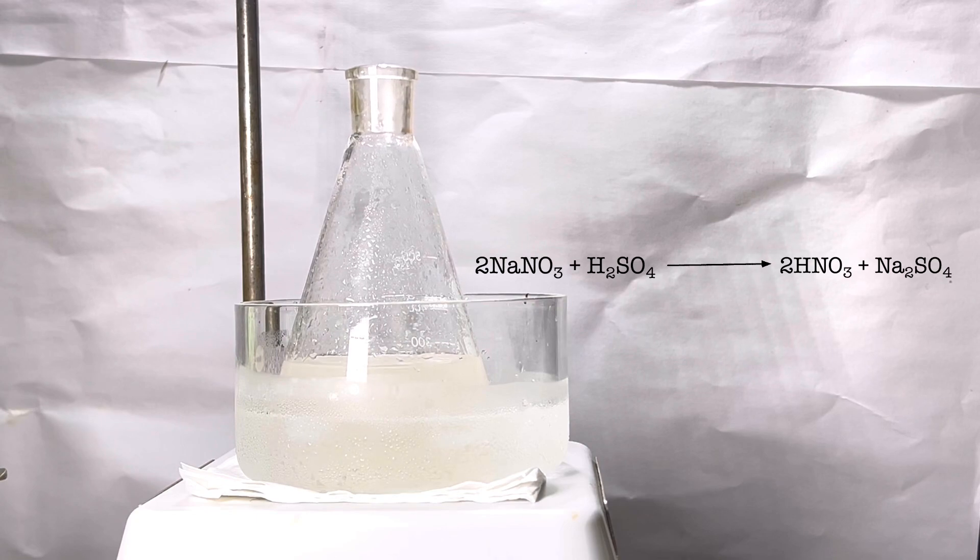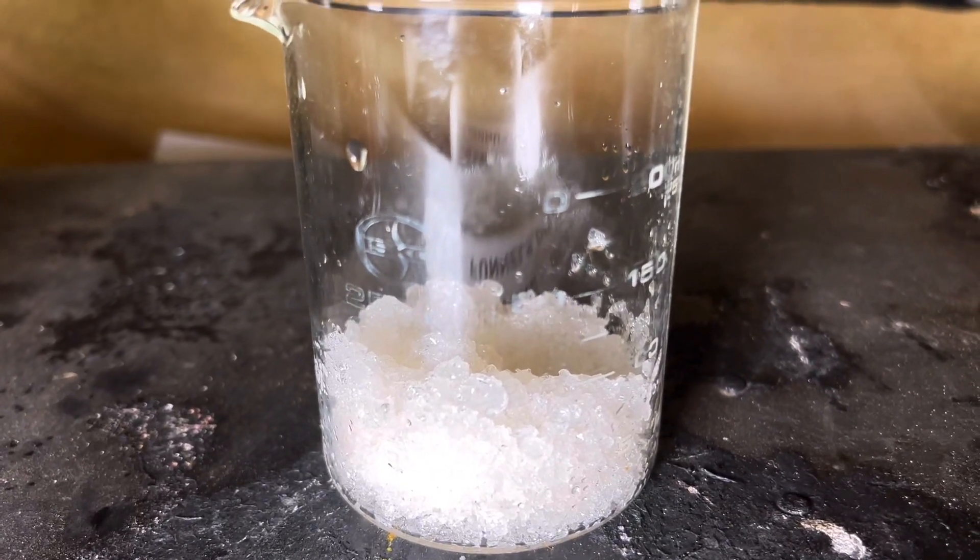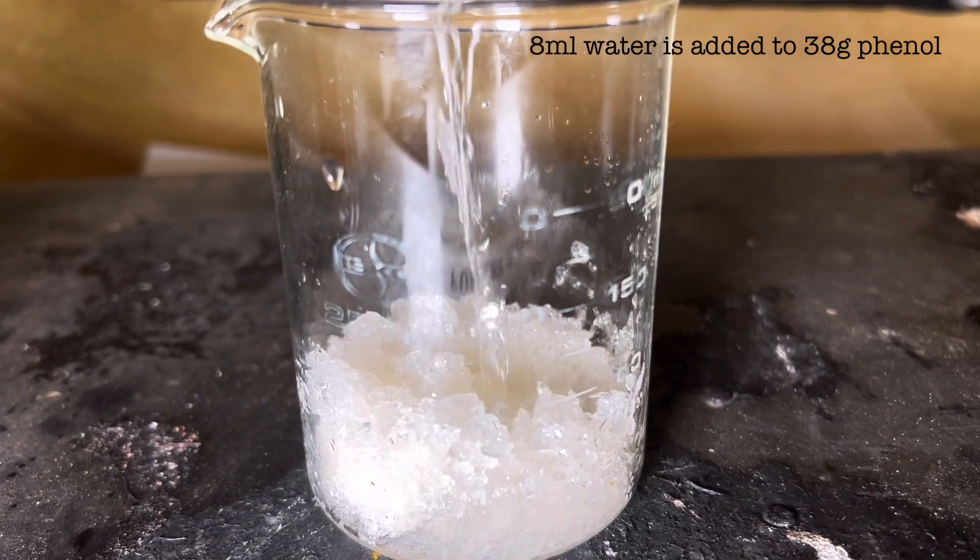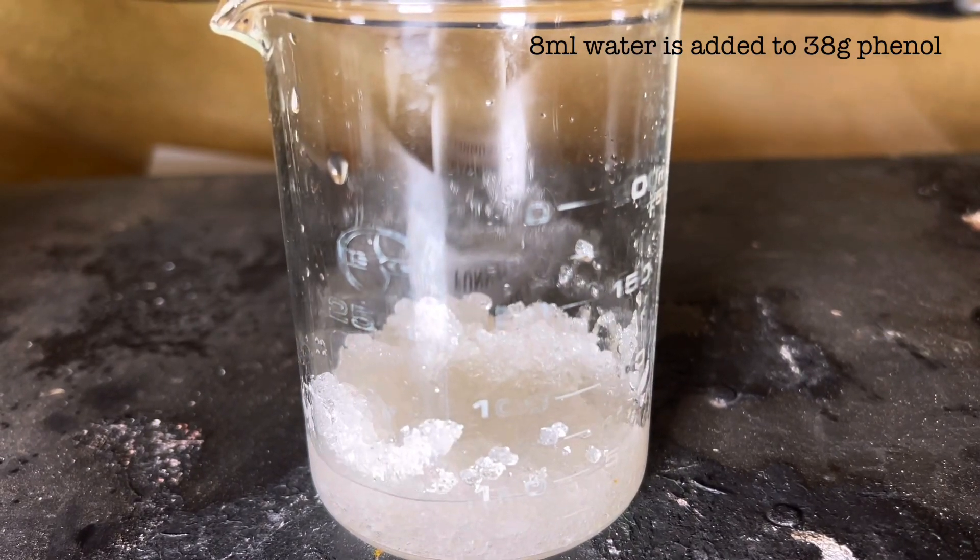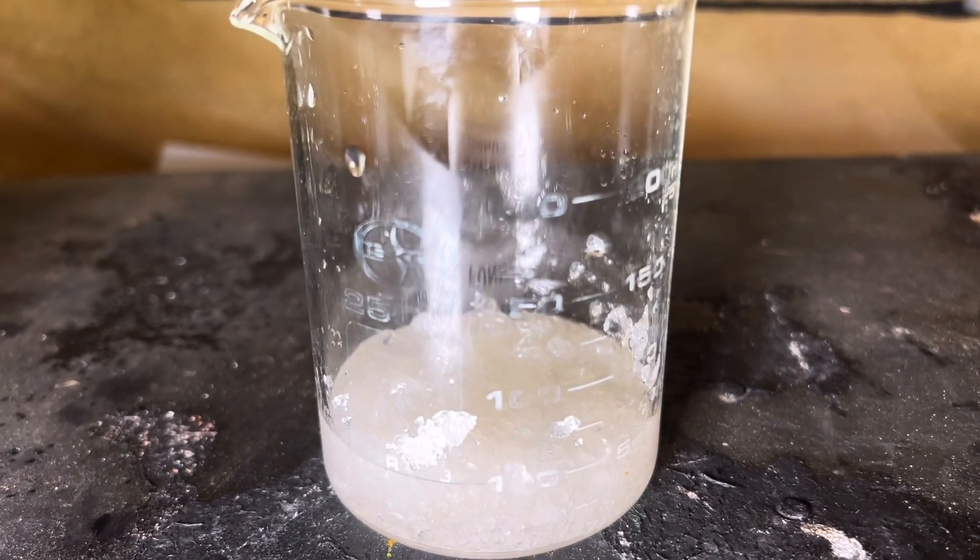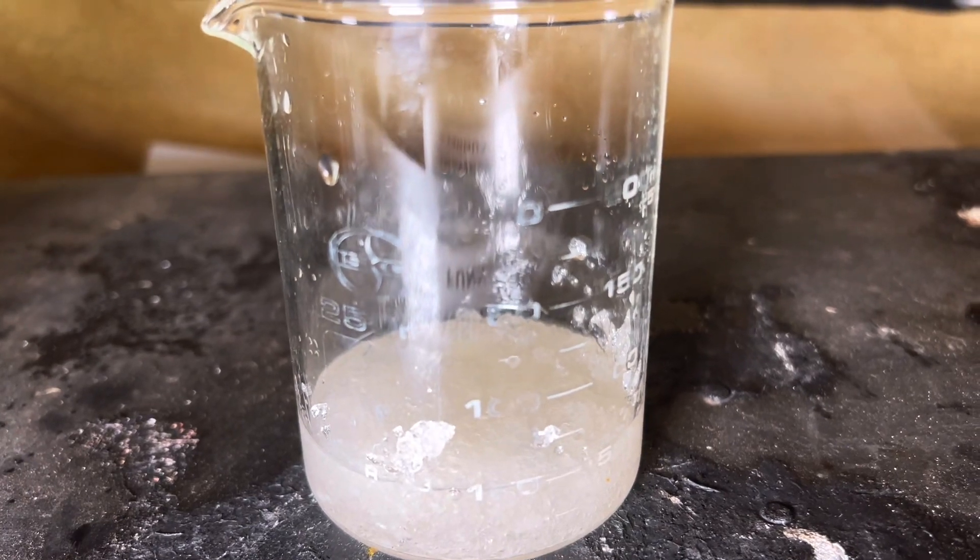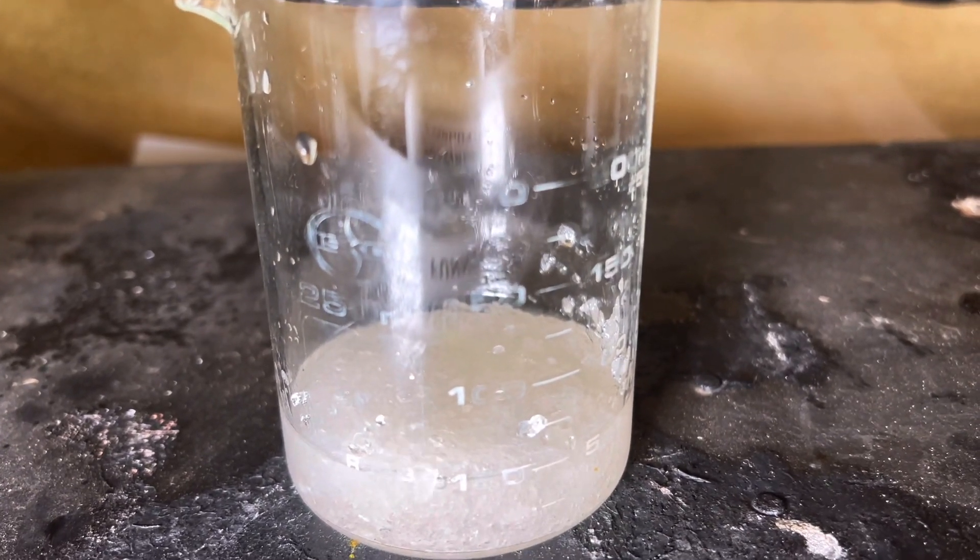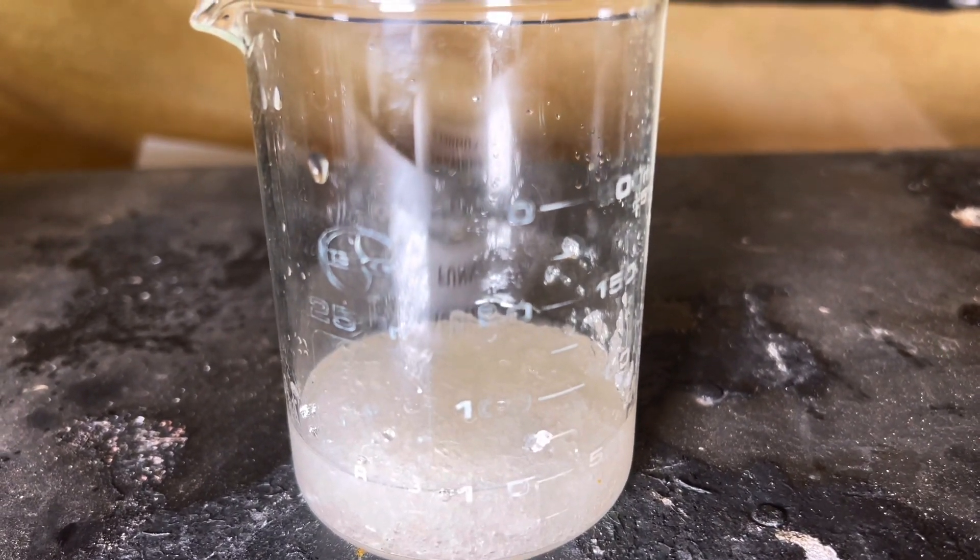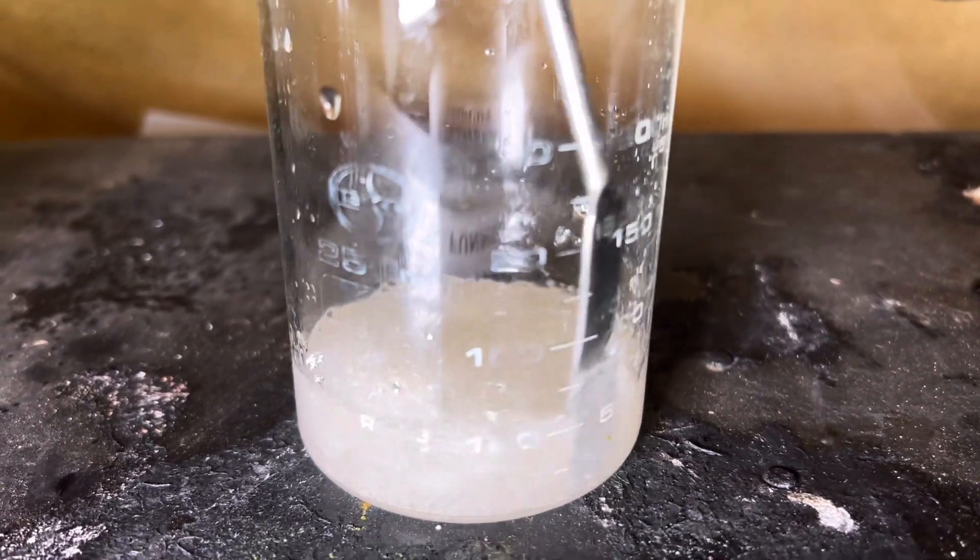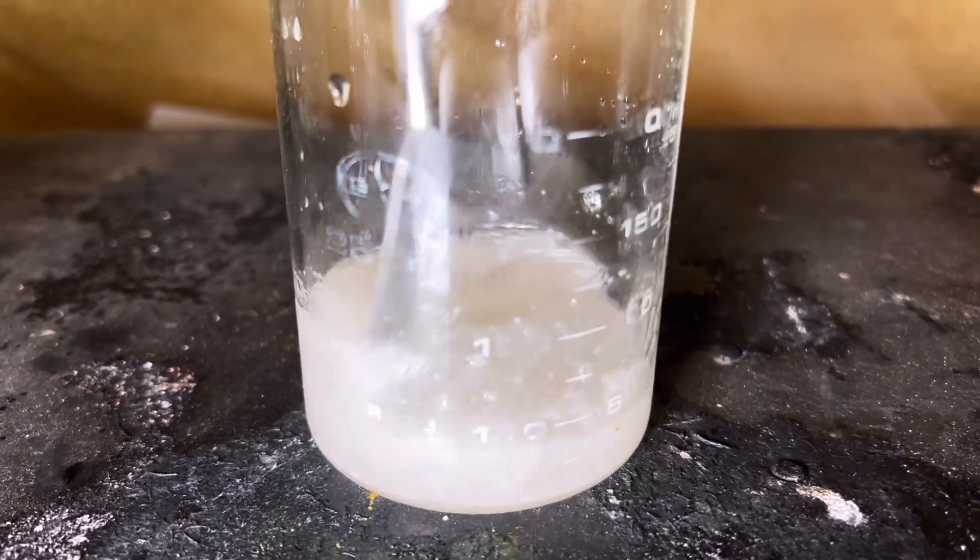While the sodium nitrate is dissolving in the acid and the flask is being cooled down, we will get ready with the phenol. 38 grams of phenol is taken in a 250 milliliter beaker and 8 milliliters of water was added. Most of the phenol would liquefy and dissolve in water. If anything is left out, gentle heat could be applied so that everything dissolves and we get a clear solution.